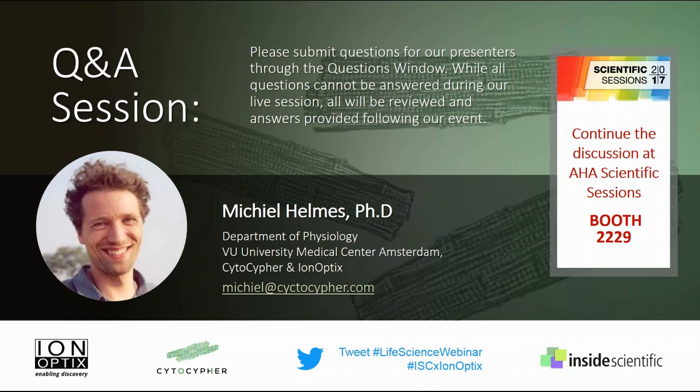So you have to figure out what works, and of course, it's a trade-off between how long you look at the cell and how many cells you can do. But that's an experimental question. You can set up the protocol any way you want. You can look at 100 seconds per cell, you just won't be able to do that many. Sure. Okay, very good. In that case, you're probably better off looking at 10 cells and coming back to the same cell every time and measuring for 5 or 10 seconds again. Okay.